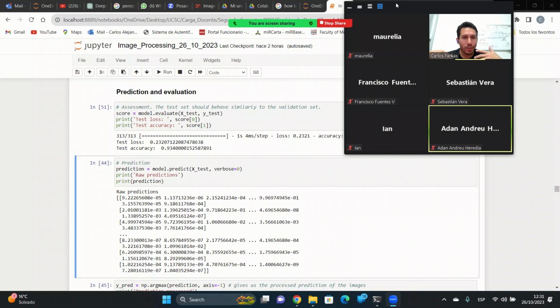You want your model to be able to generalize in the data. What if I have an accuracy of 60%? Very bad. But what if this model behaves very well regardless of the type of the data? That's what I want to show. For instance, in breast cancer or melanoma detection, the models behave at 75%.